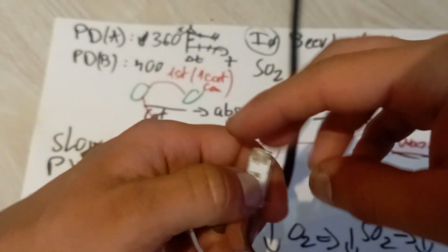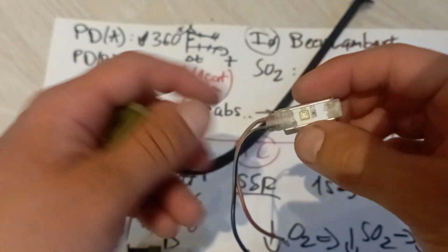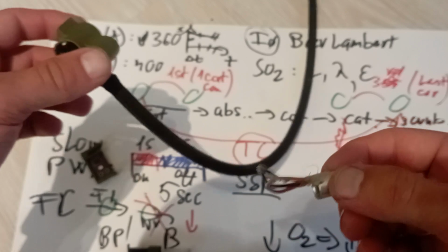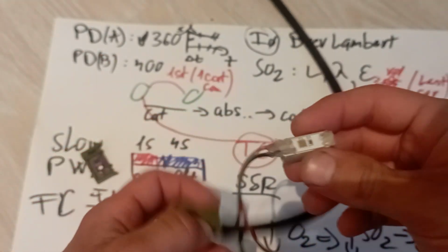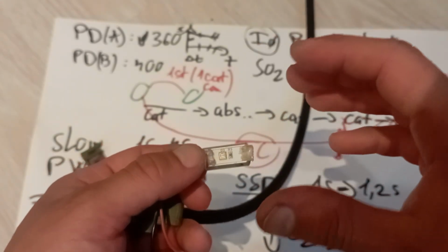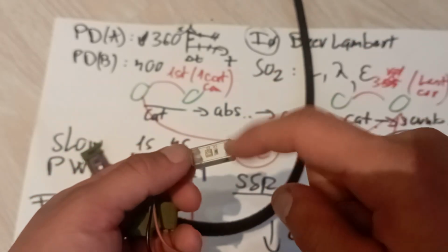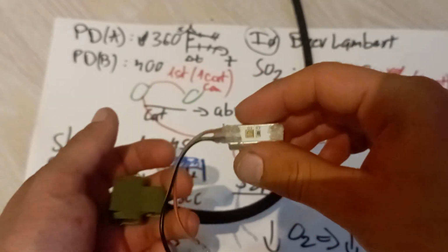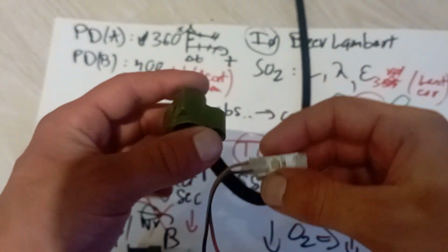Yeah. So there's the LED right there, which emits some UV light, the necessary UV lights, the 230, 250, 320 nanometer wavelength UV lights, which are, as I said, out of the visual range. It also emits some 430 nanometer light, so you can actually see if it's on or not, because you basically can't see the UV, and it damages your eyes as well. So you need to wear some protective lenses or UV absorbing lenses.